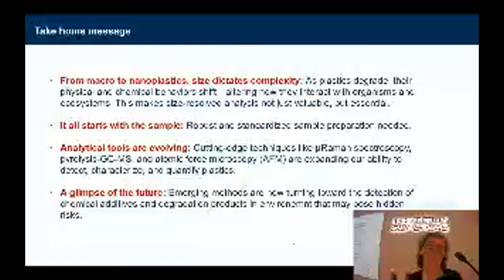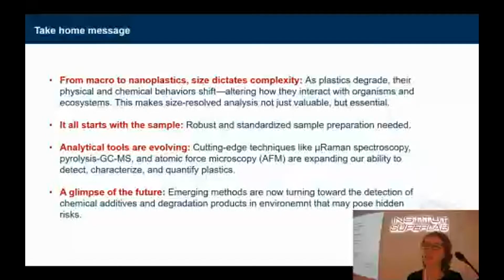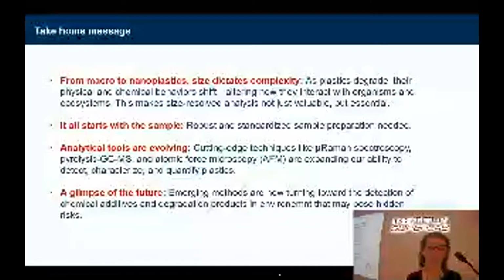Of course, depending on the particle size, you will use different analytical methods. Of course, the environmentally relevant samples are more complex. We have, of course, to have a standardized sample preparation method. Alexandra already mentioned that there is not much standardization. Intox is working a lot on this now, and in the future for sure.